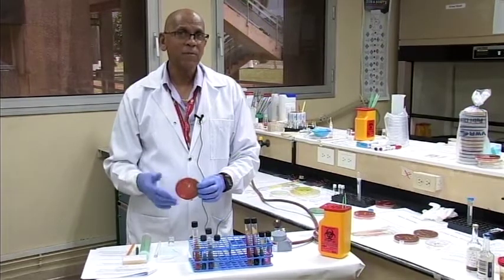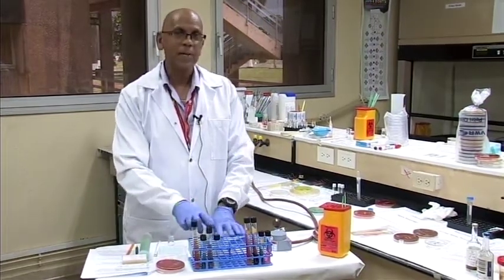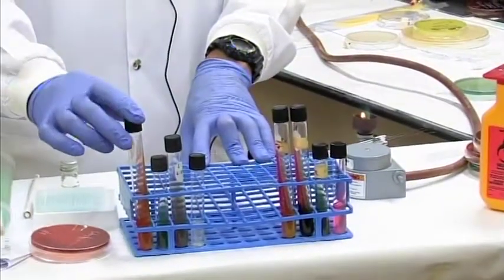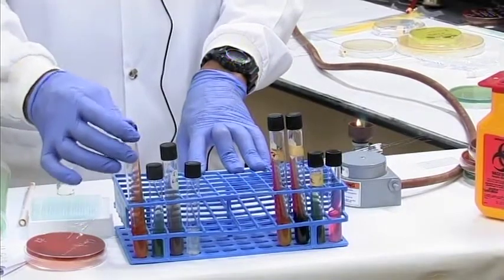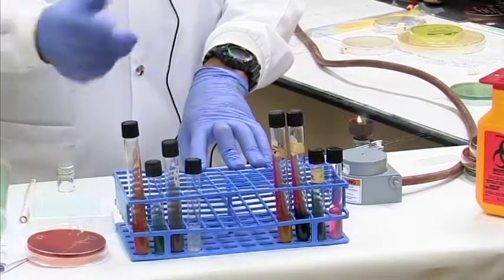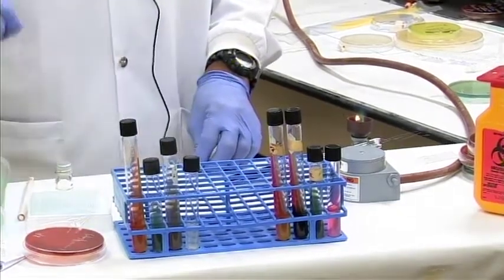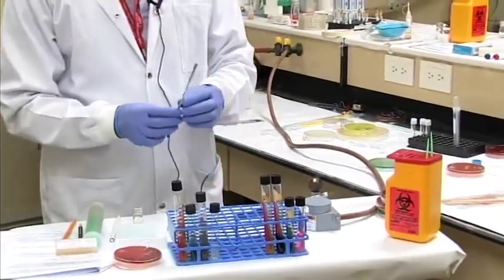For your gram-negative rods, like members of the Enterobacteriaceae group, you'll want to use these two biochemicals. We have some examples here which are going to show you how to inoculate. One of the tests we can do is called a TSIA, which stands for triple sugar iron agar. We also have a citrate test, motility test, etc. I'm going to show you how we inoculate these tubes to get our growth reactions to help us identify the bacteria. What we'll need is another tool called a straight wire.